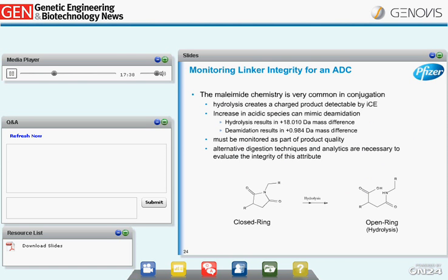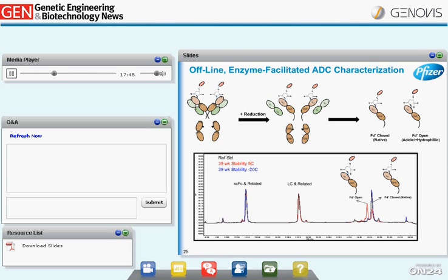These are both quality attributes that would have to be monitored and controlled throughout both manufacturing and storage of the biotherapeutic. Doing just that, we developed an assay to monitor the open ring structure and the closed ring structure. Now, to repeat, the closed ring structure is the native version. The open ring is a degradation product, so that forms an acidic charge. It's a hydrophilic modification that we're now able to monitor utilizing a similar separation using UPLC. The separation below depicts the single-chain FC and various related components of the single-chain FC.